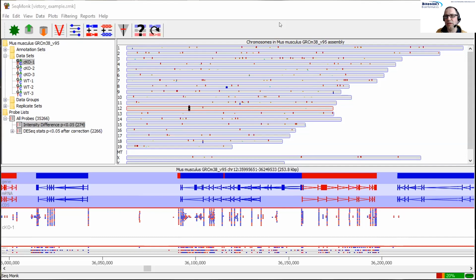They get populated automatically, and the general rule for what goes in here is anything which has generated data, modified data, or done any kind of filtering or statistical test should show up in the Vistory.